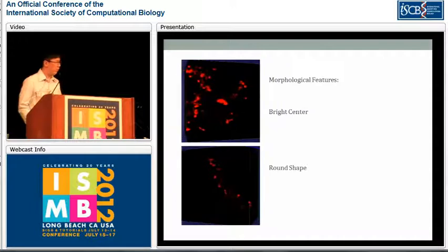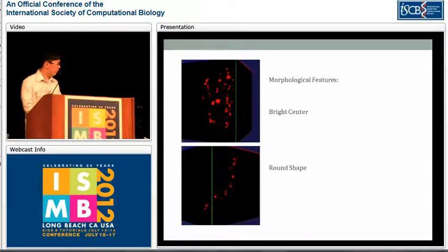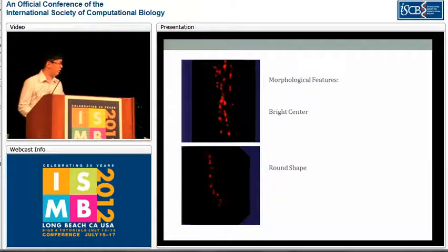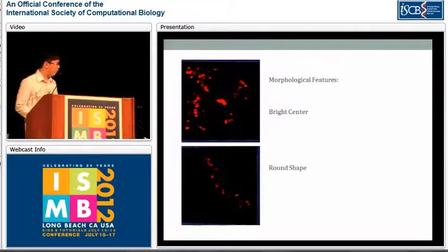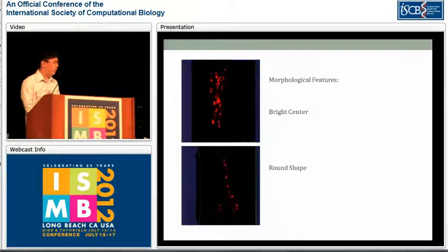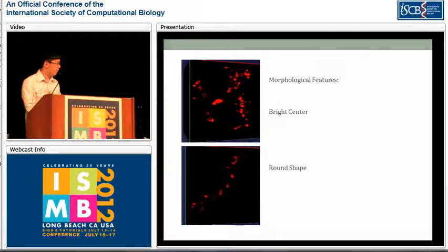After removing the background, the image can be separated into many connected components. If the actual synapse signal is isolated, it's fine. We can just get the size and location. But if several signals are connected, we need to find a way to separate them. So it comes to a question: what identifies a single synapse signal? After inspecting the image, we choose two morphology features to use to detect a single synapse.